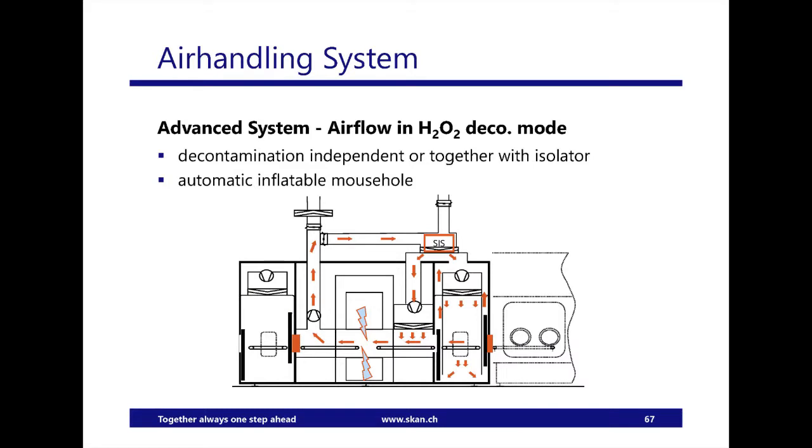We have automatic mouse holes, inflatable seals, which inflate against the shutters here and here. This is the entry section here. You see it's not getting decontaminated. And so we have all possibilities to decontaminate.